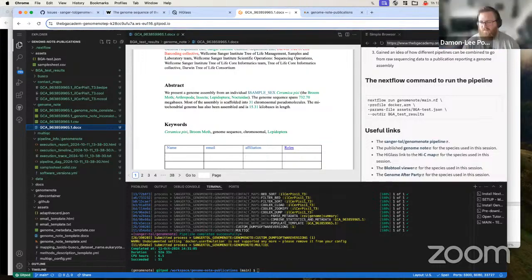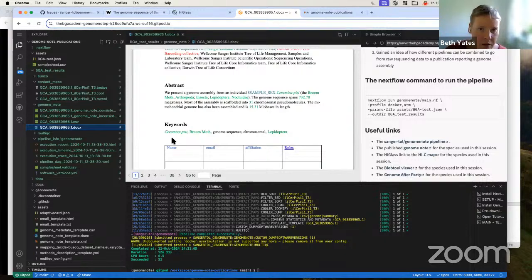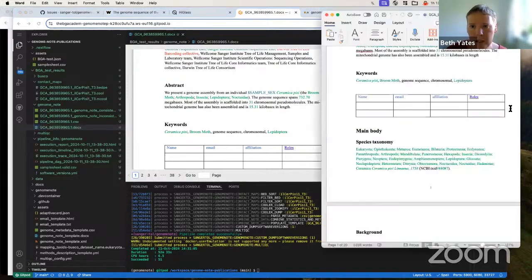For automatic review, could you share what type of metrics you think would be useful? The automatic review uses the metrics that are in the BGP paper, which I had linked in the slides.